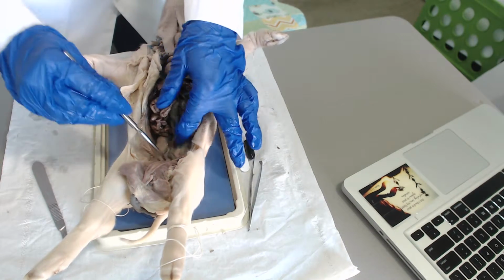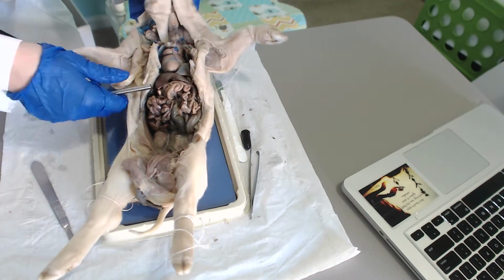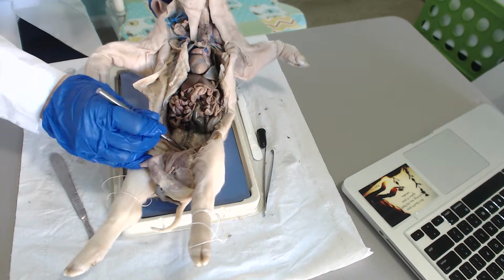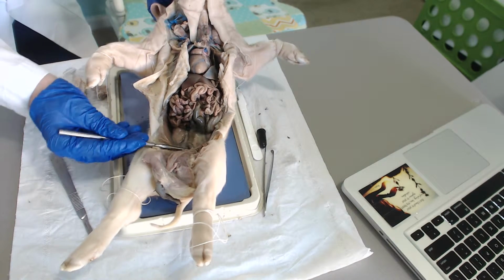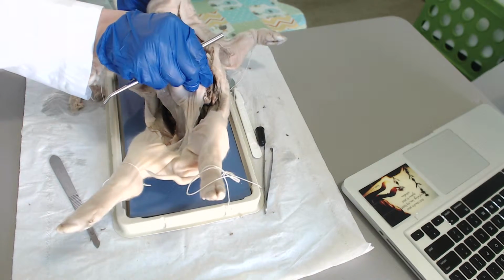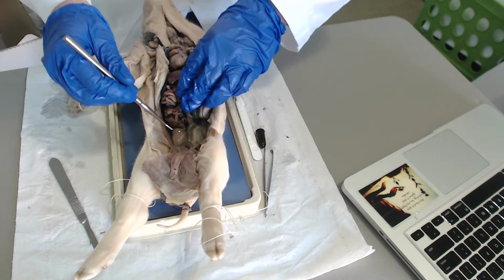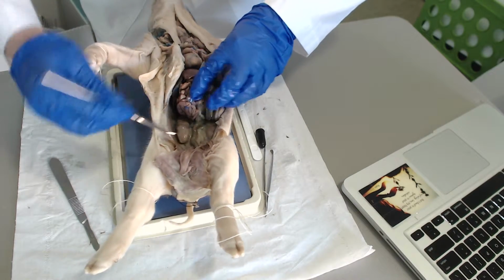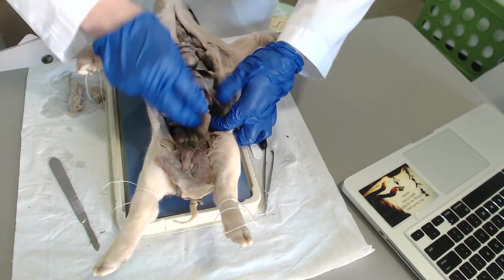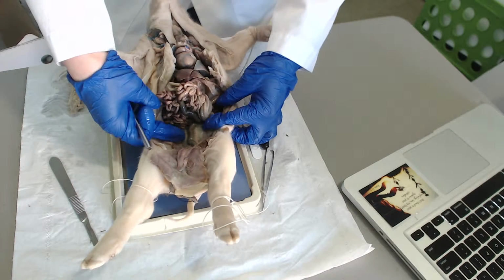Now you have the rectum, and if you lift up, so the rectum, you might be able to see, is right down in this canal right here. You can actually see the colon leading down into the rectum, and it goes out through the bottom. Okay, so you have the rectum, the kidneys. If you pull back, you can see a kidney on each side, back behind. So you have the 2 kidneys. Okay, so again, those are the kidneys.